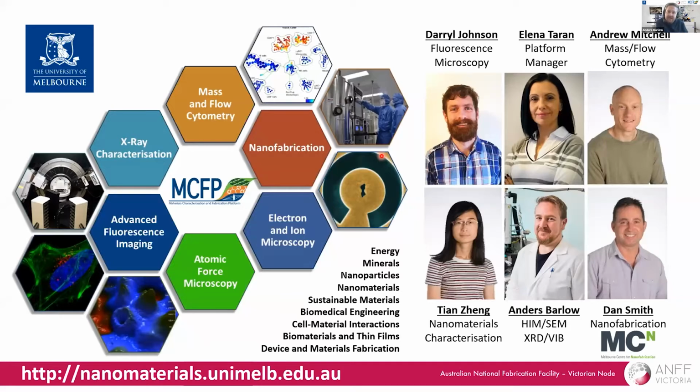I'm going to give you a little bit of a highlight about the MCFP, the Materials Characterization and Fabrication Platform, which I'm a part of. And you can see that we have lots of different capabilities. We're a very broad-reaching research platform within the University of Melbourne. And we sort of break up into 6 different research nodes or capability areas. In particular, I look after our electron and ion microscopy, and the ion microscopy part will be a little bit of a focus for today.